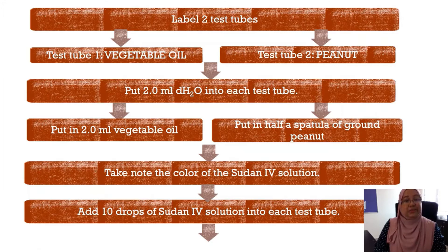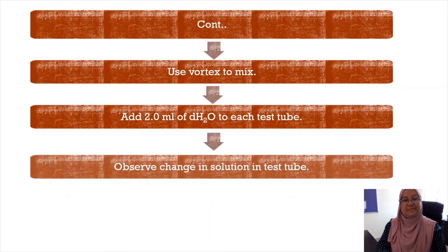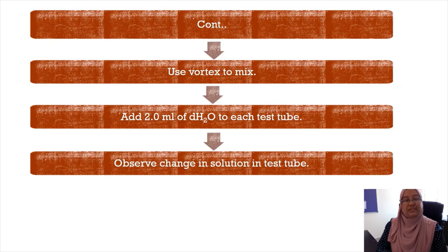This is the final procedure to determine the presence of lipid. Label two test tubes: test tube one for vegetable oil, test tube two for peanut. Place 2 ml of water in both test tubes. In test tube one, put in 2 ml of vegetable oil; in test tube two, put in half a spatula of ground peanut. Take note of the color of the Sudan IV solution and add 10 drops into each test tube. Mix both test tubes using a vortex mixer, then add 2 ml of water to each test tube and observe any changes.